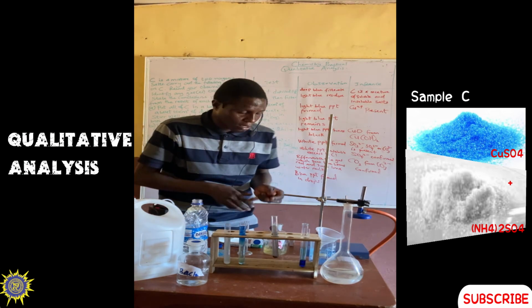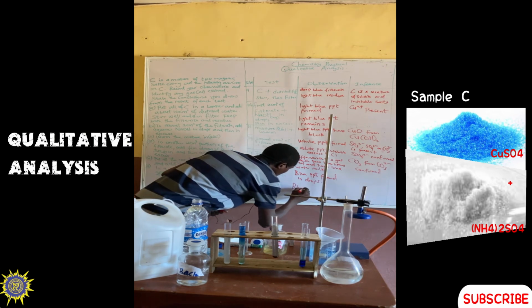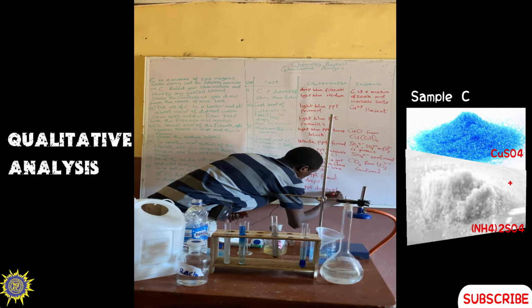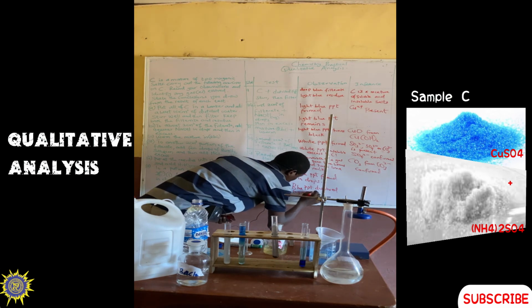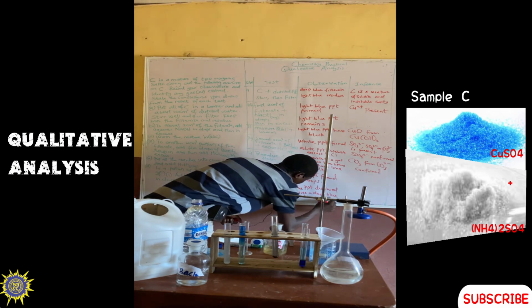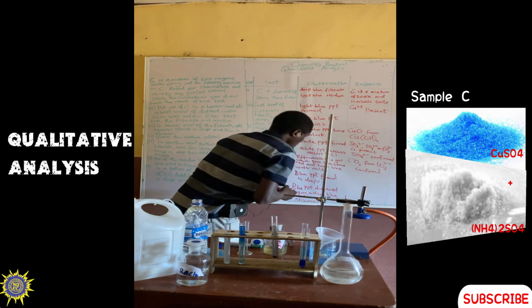The blue precipitate dissolved to give a deep blue solution in excess aqueous ammonia.